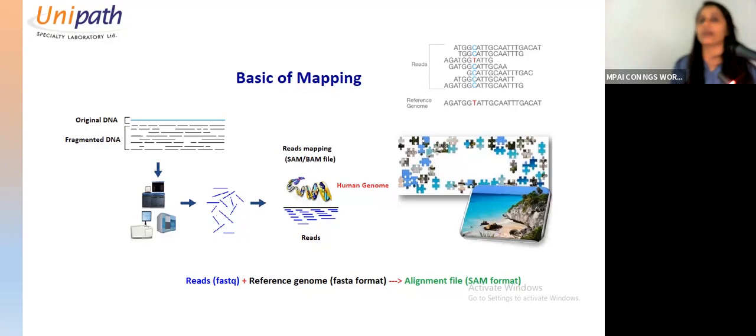When you analyze, after that, you get to know about the variant allele frequency. If half of the reads represent the reference genome, that is T, and half of them represent C, then it is a heterozygous mutation. If all the reads, here it is just 10 reads, otherwise you can consider it like 100 reads, are representing C, and in the reference it is T, that means it is a homozygous mutation, right?